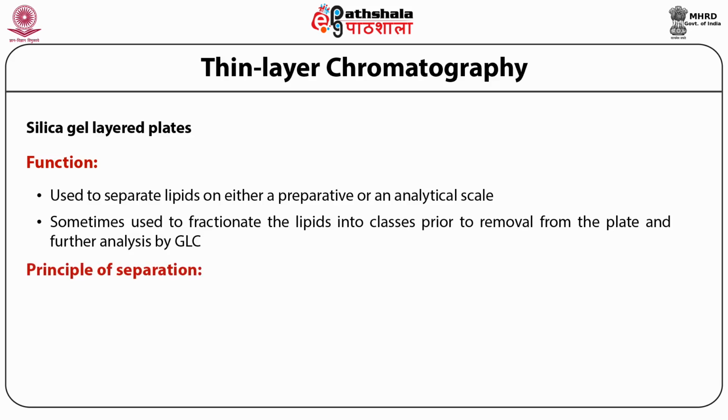So the principle of separation remains the same. Since the silica gel is layered onto a glass plate, the stationary phase is polar.